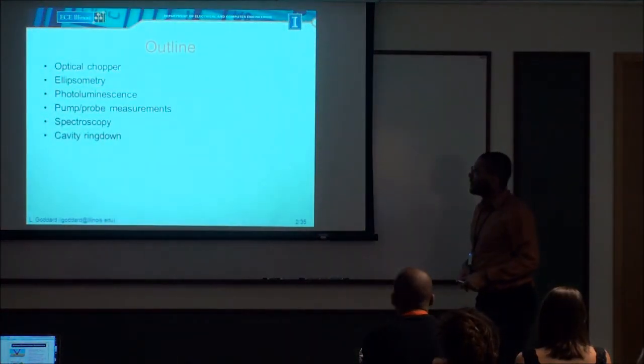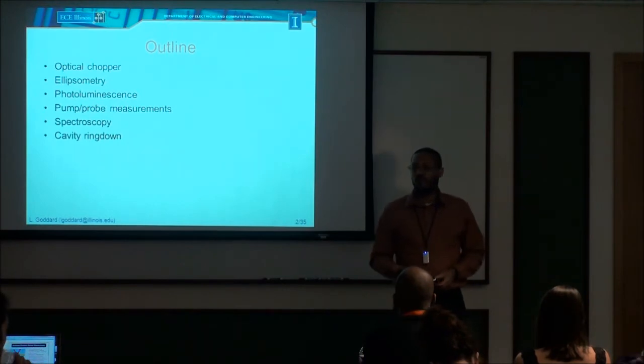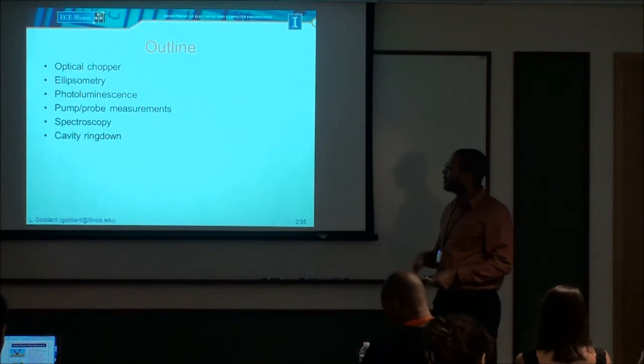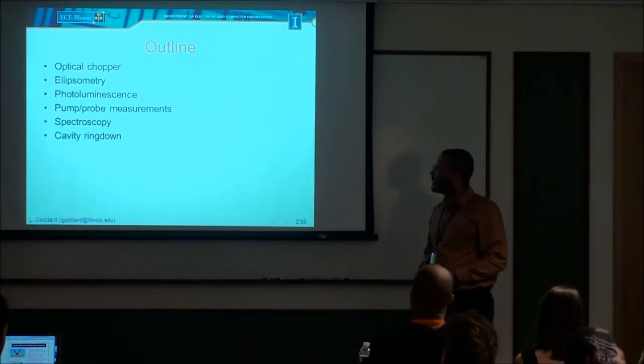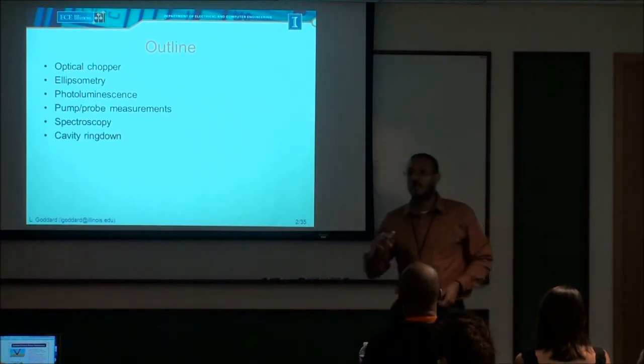So the outline of the talk, I'll talk a little bit about how optical choppers work. So they're a very common tool used in laser measurements. And then I'll talk about some classical material science measurement techniques, ellipsometry, photoluminescence.